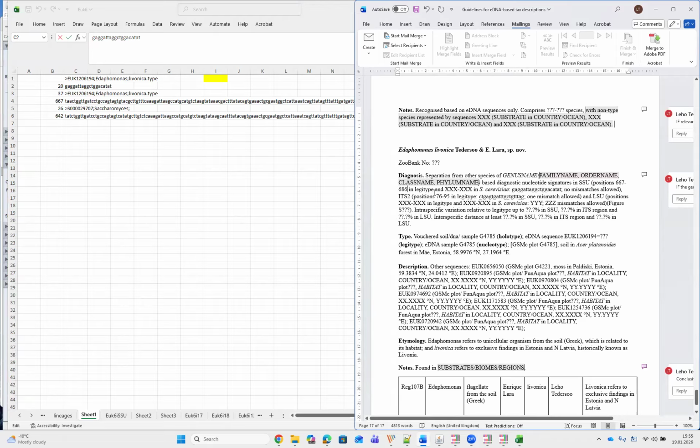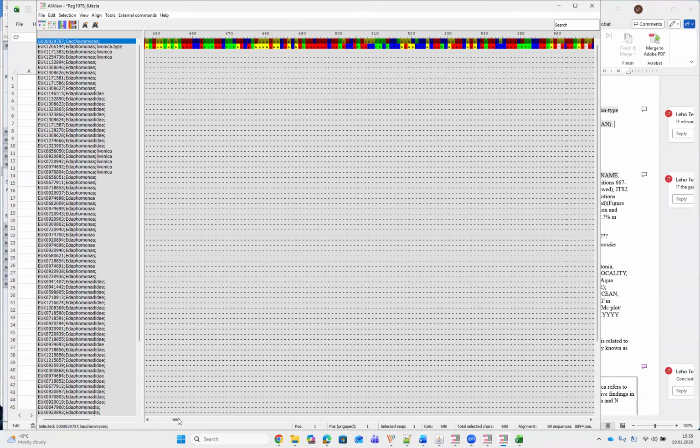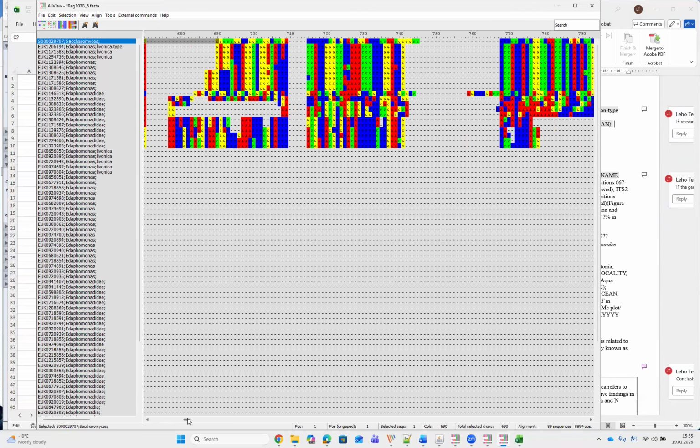And 642 to 661. Again, let's determine the very characteristic differences.